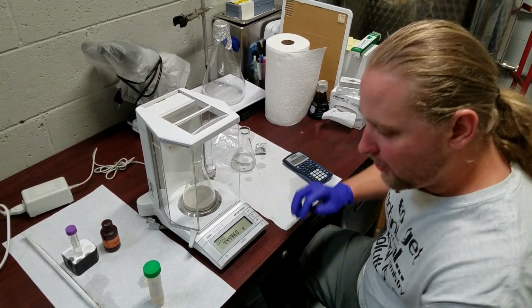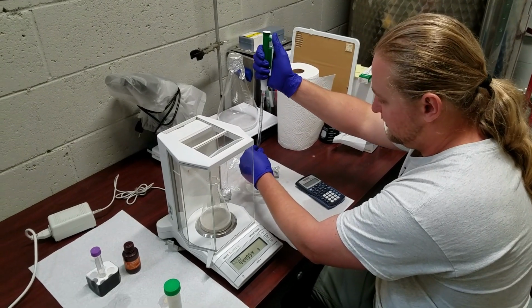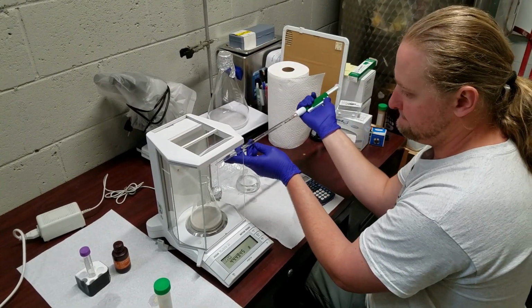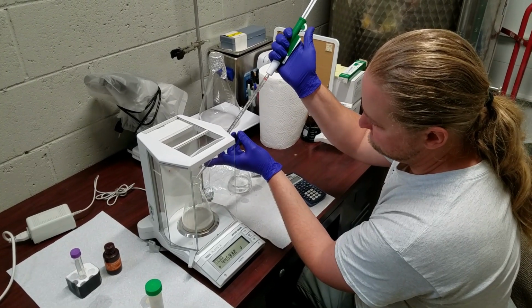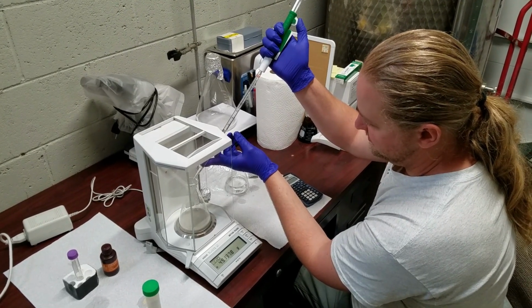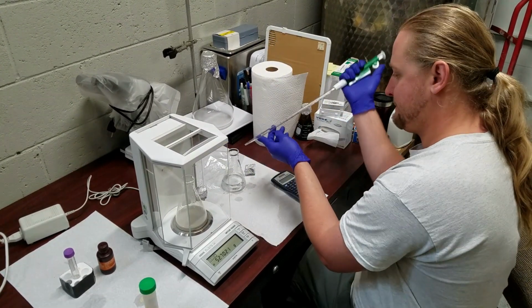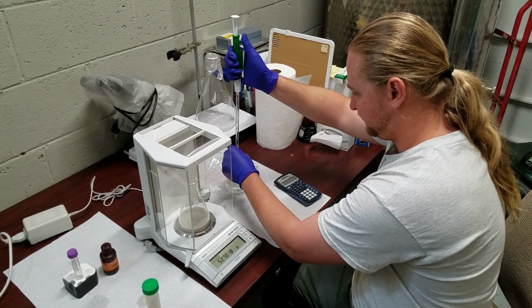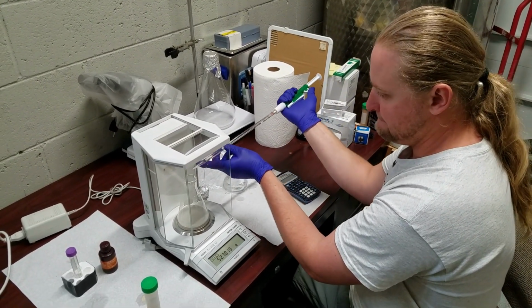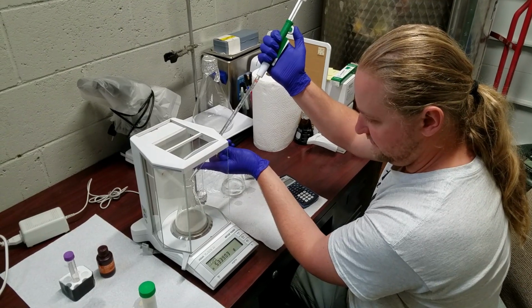We got it close to about 44. Now we'll take our pipette here and we're going for 58.2. So that is a little more than this pipette will hold, so we're going to have to do it a couple times. Just always watching the scale. And one more time, this should get us here. So you're going to want to pay attention doing this, especially if you do it in the morning of the brew day, to let you know how much yeast you're going to pitch. So let's see if we can get it to 58.2.